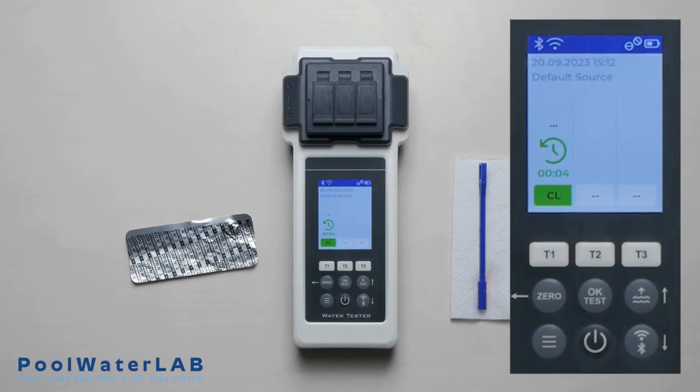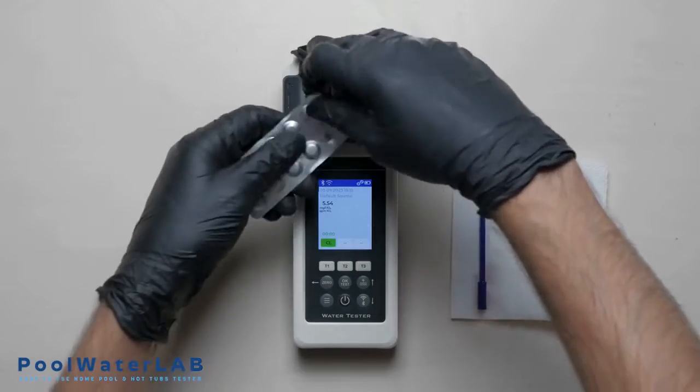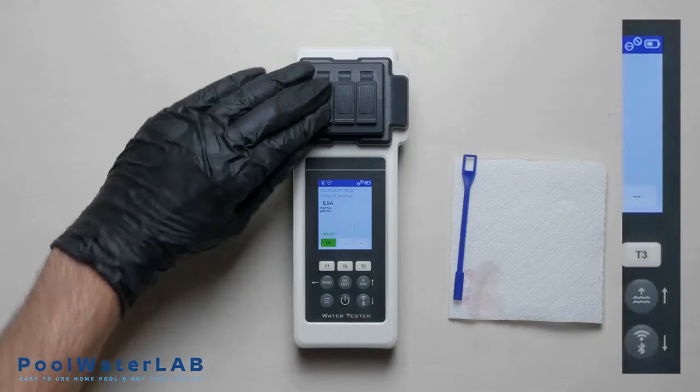Wait until the countdown ends and the test results of total chlorine appear. Then add the tablet of DPD number 3 directly into the same chamber. Crush and stir the tablet, cover the measuring chamber, and press the T1 button.